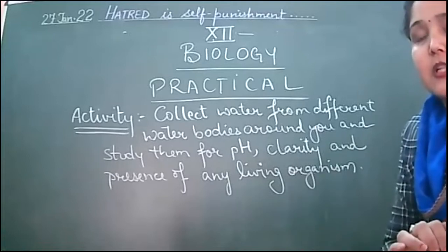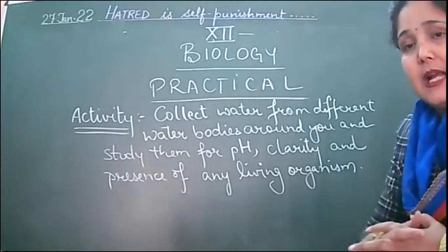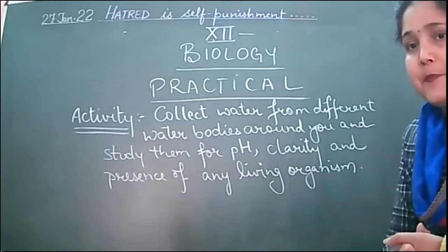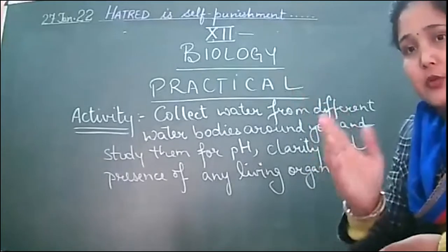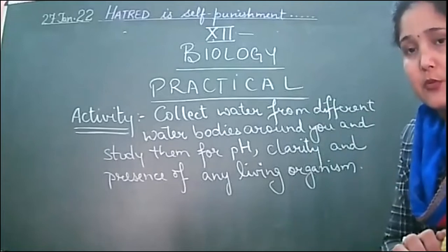You will be looking at the different microorganisms which are present. If the water sample has a lot of microbes, depending on what kind of water sample it is, like pond water, then you will find a lot of microbes and organisms in it.